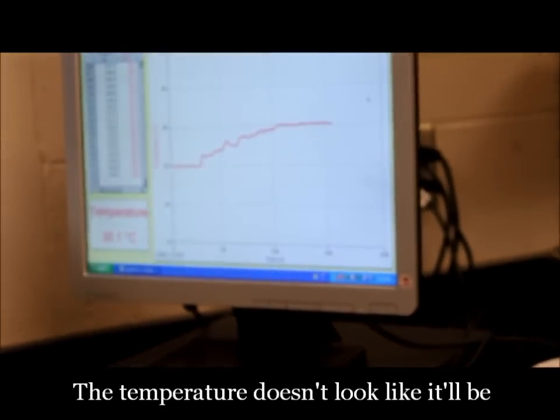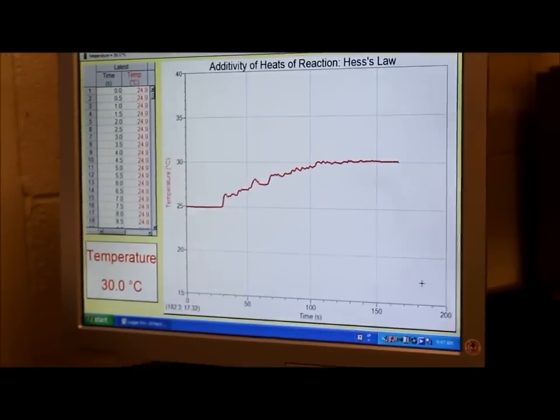The temperature doesn't look like it will be changing much, so we can stop the data collection here. So that's our first reaction.